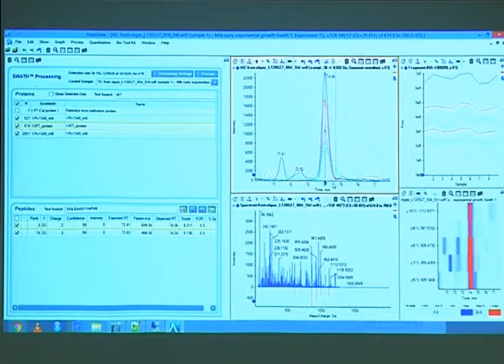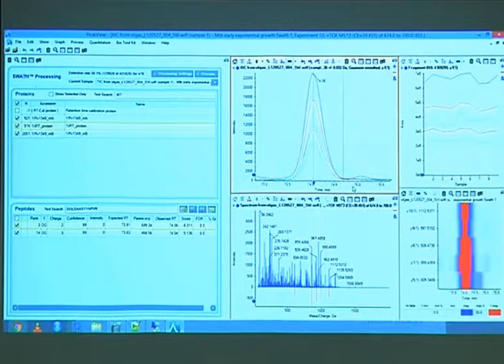So this is how a peak group should look. This is a good result. Since we spiked them in, it's not that surprising, but at least it's good to know that if you spike something in, you also see it there.